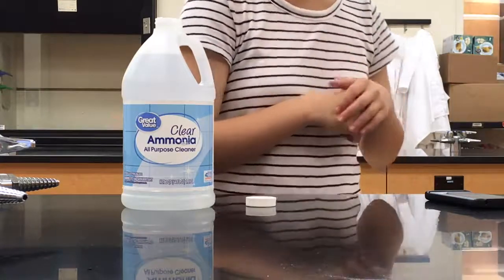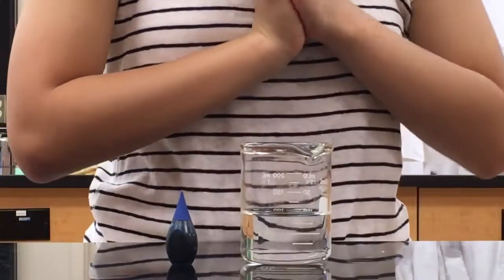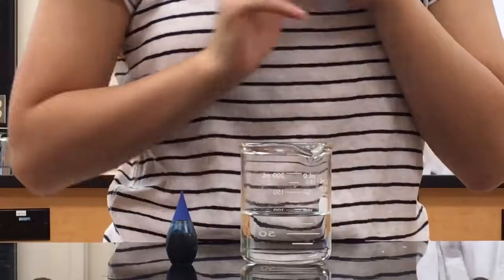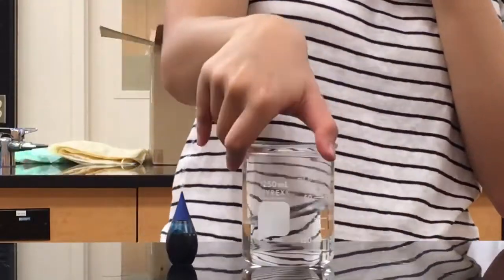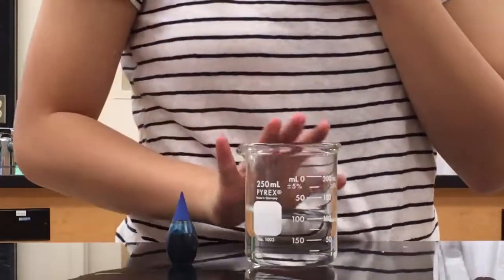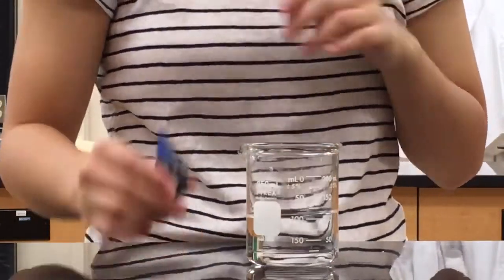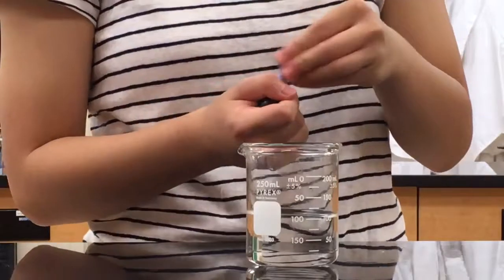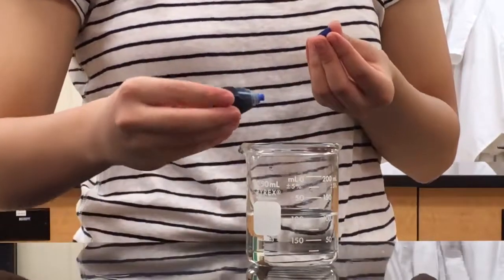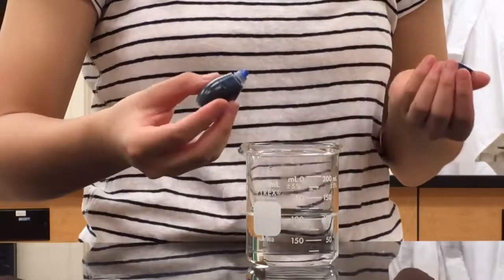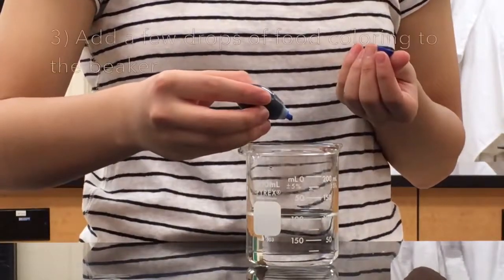So today we're talking about the motion of particles in water and ink. All you need is a 250 milliliter beaker and 100 milliliters of water in it, and you just need food coloring as well. So what you're going to do first is just drop some blue ink, and you have to ask the kids to observe what's happening to the blue ink as you drop it into the water.